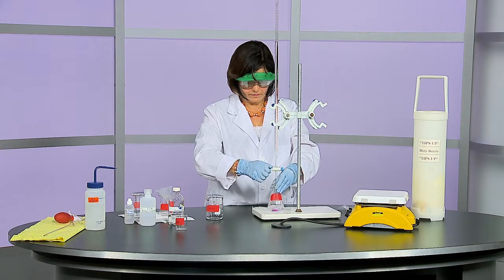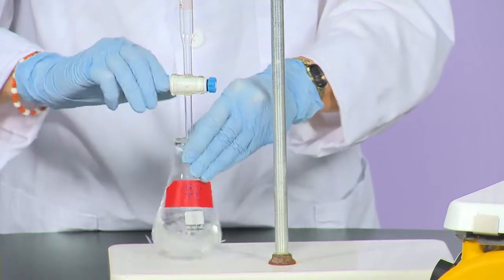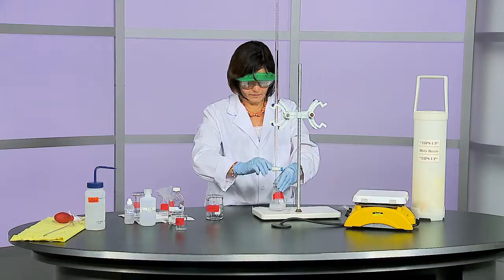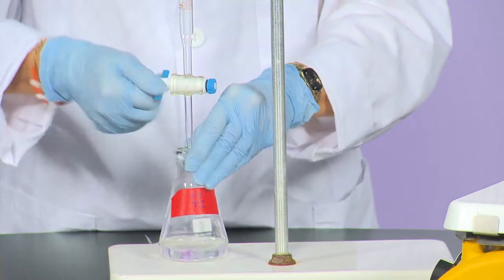This means titrating an extra sample first, allowing the titrant to flow quickly. When the sample passes the endpoint, estimate the amount of titrant used, then discard the sample since the endpoint was passed. This allows for an estimate of the endpoint to save time on the actual trials. The data for the rough titration is not recorded anywhere.